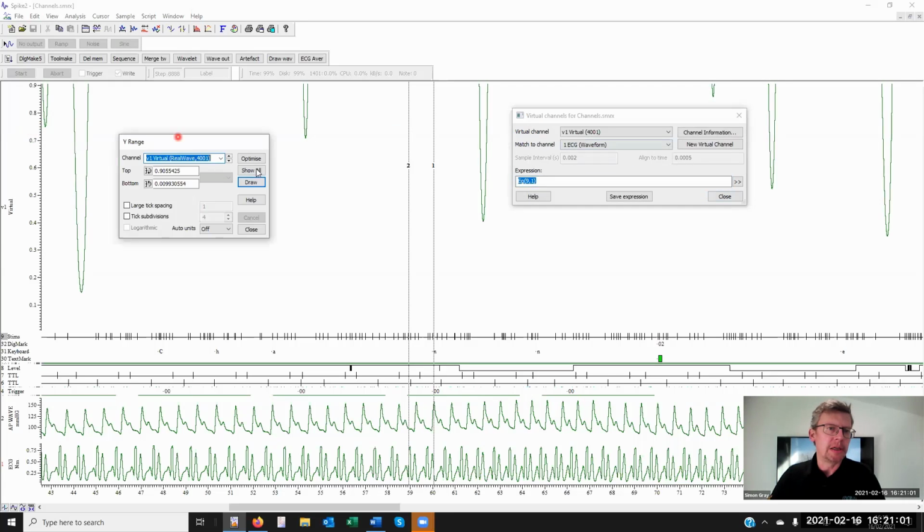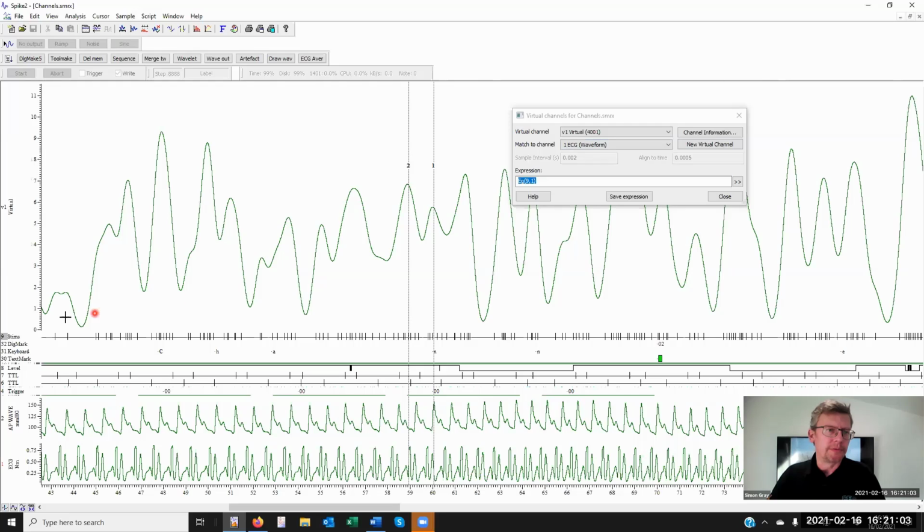Now you'll see we've got a waveform changing in amplitude. As the events sum, Gaussians are fitted to each one of these, and they sum and form this rather irregular waveform here. So this could be used, in one case, for heart rate variability. It could be used directly on fast spike data and gives us some information about frequency.